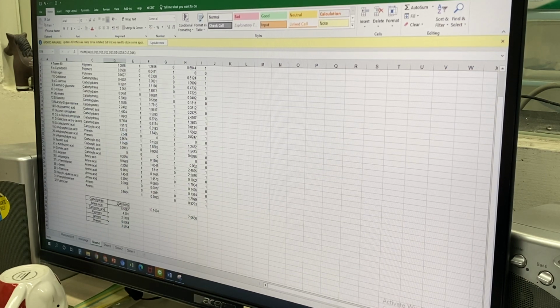Okay? Then you just need to drag it. All the data has come out, you know.